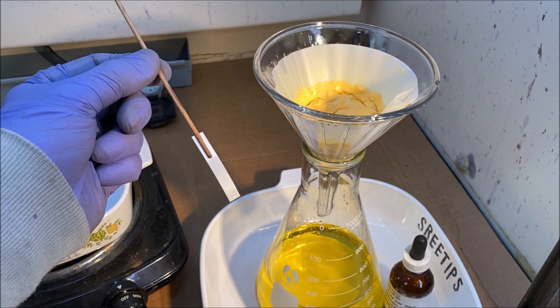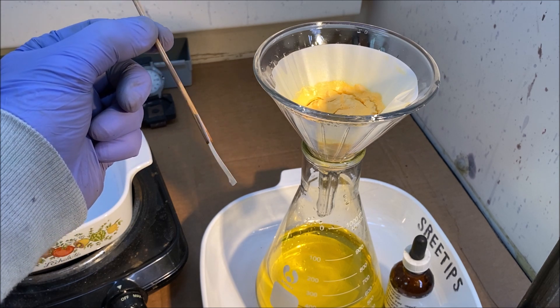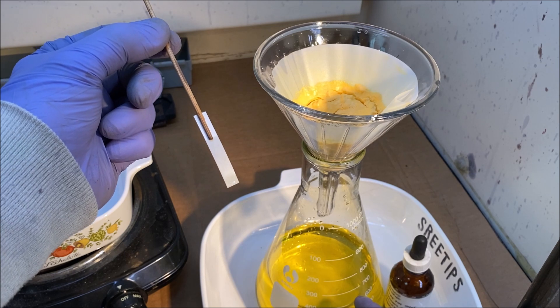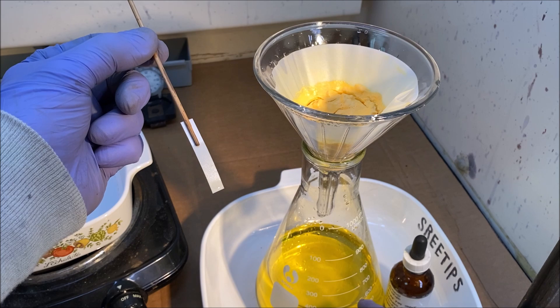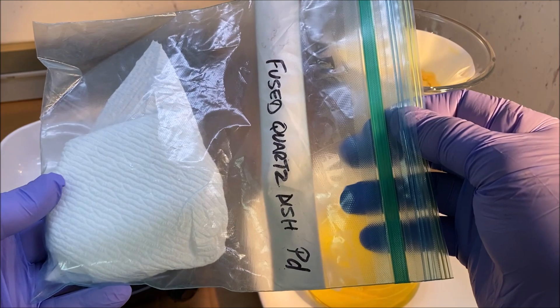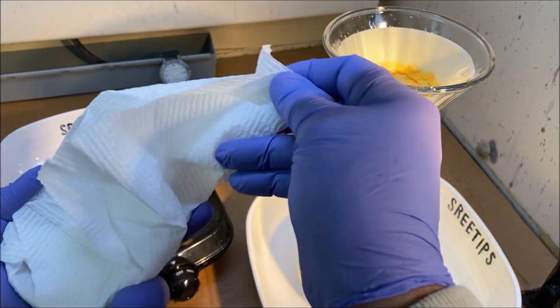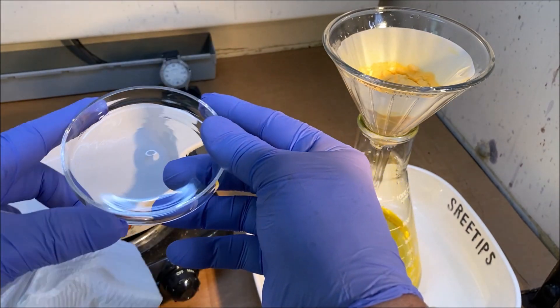Barely anything — maybe just a trace of precious metals. These waste solutions that all the precipitate has been extracted from will all go into my stock pot. Now what we're going to do is get our palladium salt into a fused quartz dish and we're going to burn it and get our pure metal.